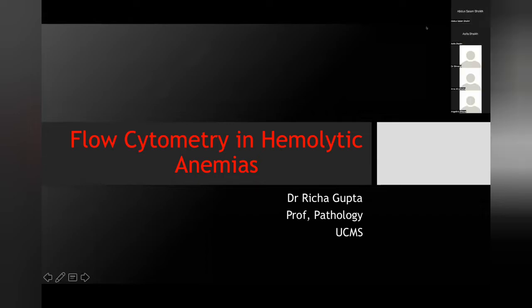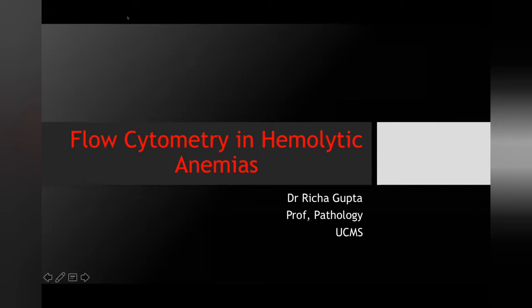So flow cytometer is something which we all know about. It has become very popular since the last 2-3 decades, and almost all good institutions now have a flow cytometer. But if we talk about uses of flow cytometry, most of you would tell me about immunophenotyping of leukemias, lymphomas, and other malignant disorders.